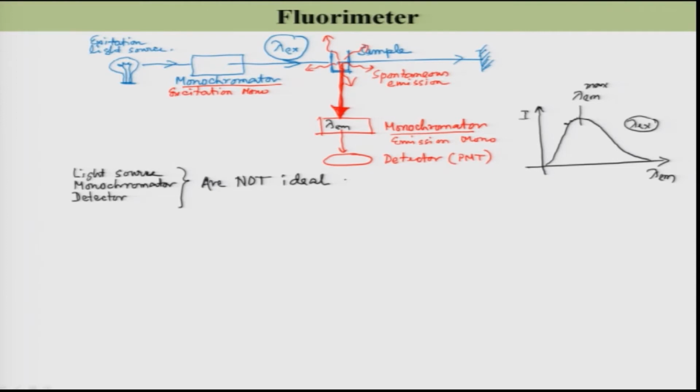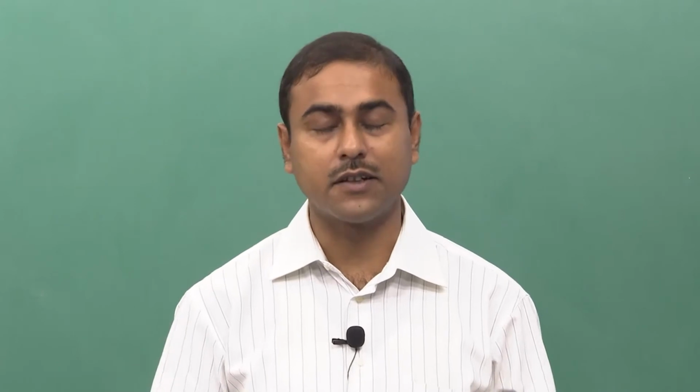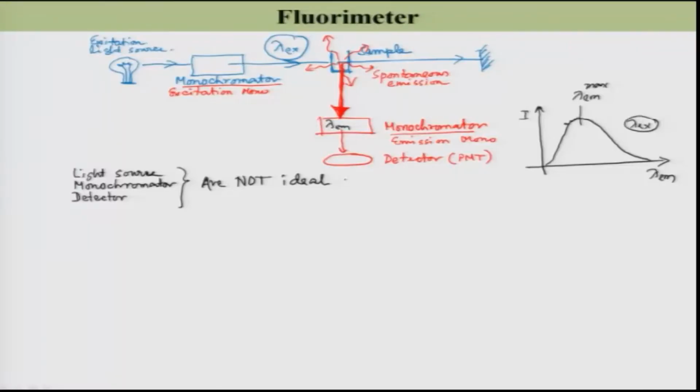Why do I want to discuss these things? Let us start with the detector part. Let me draw an emission spectra of a particular compound, and let us assume that somebody has given you that emission spectra, which is the correct emission spectra of that particular molecule. Let me draw the emission spectra for a molecule X, using red color. This is the axis.